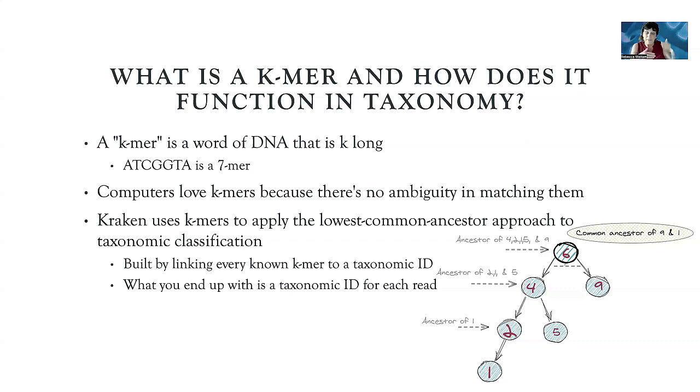And so then you can bin those, because if you know who they are, then you have a bunch of data at kingdom, as it builds up. So you have some data at the species, quite a bit actually, but there'll be more at the genus and more on the way up of unique k-mers to each taxonomy.